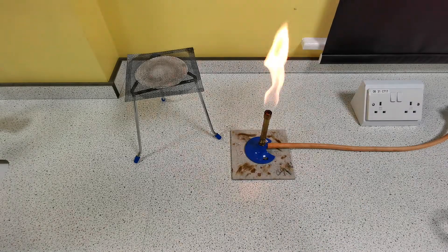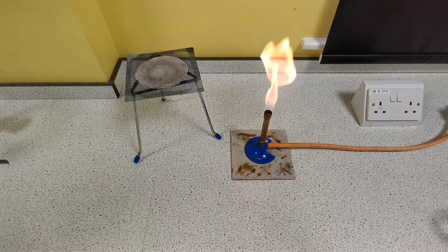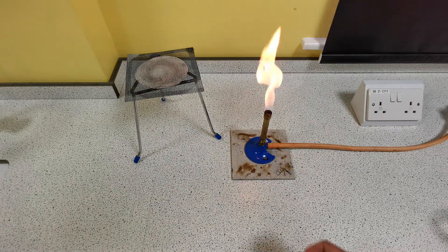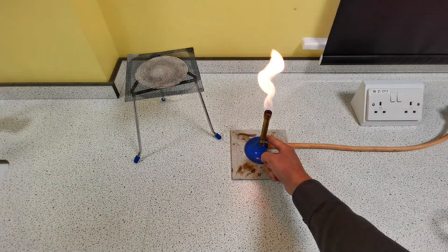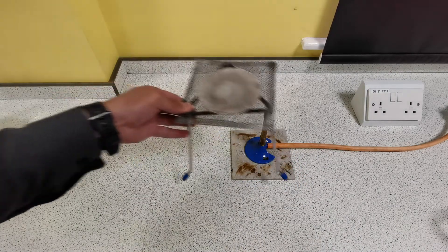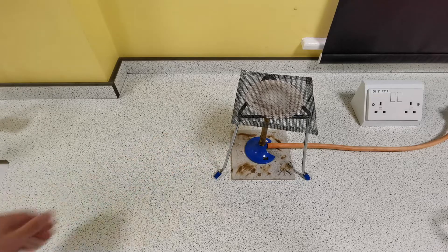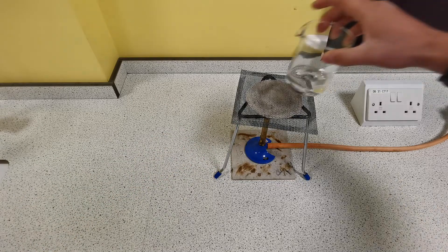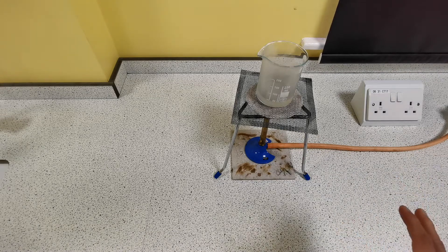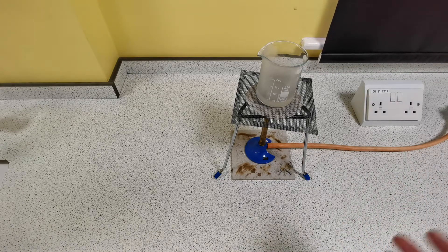Next we are going to warm the acid to increase the rate of reaction and to make sure as much copper oxide reacts with the sulfuric acid as possible. To heat, we use the blue flame and not the orange safety flame. We don't want to boil the sulfuric acid because that's dangerous — we don't want it giving off any dangerous gases that we can breathe in. We're just going to warm it.